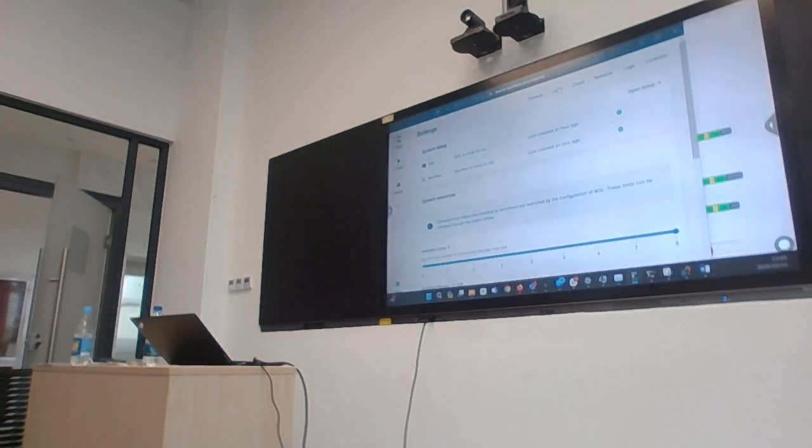Now, once that's all done and then once that's installed, I must add your user. The only thing here is, this will install Docker, okay? But your user must also be in the Docker group, okay?